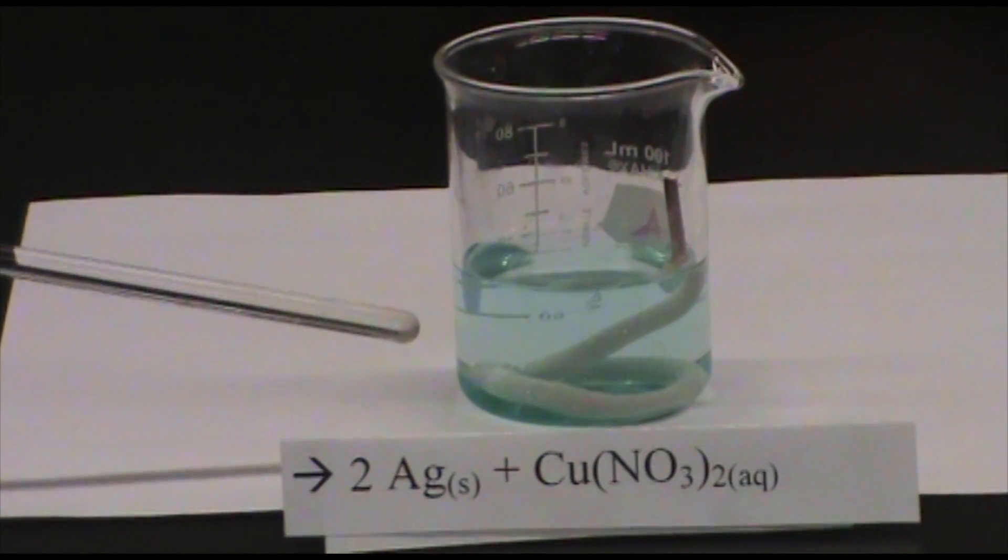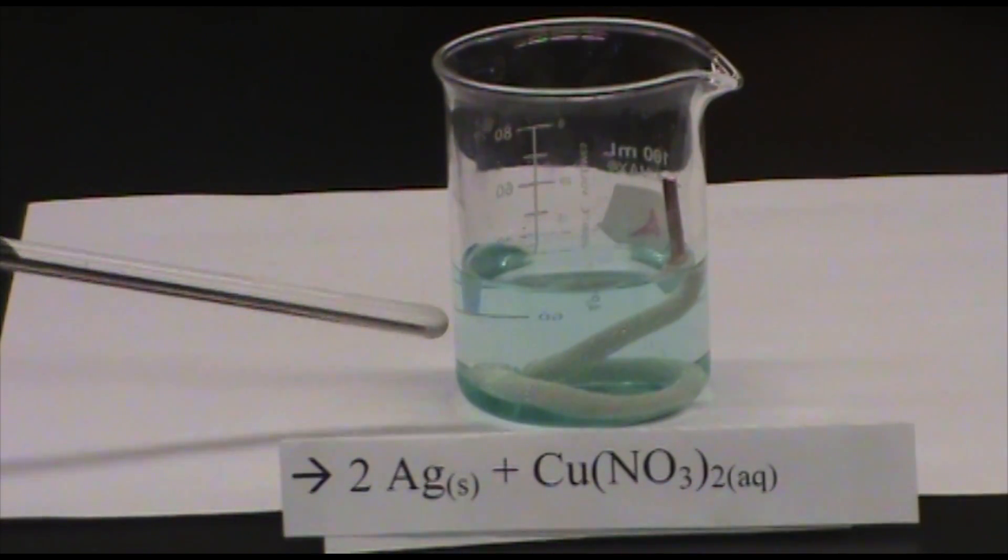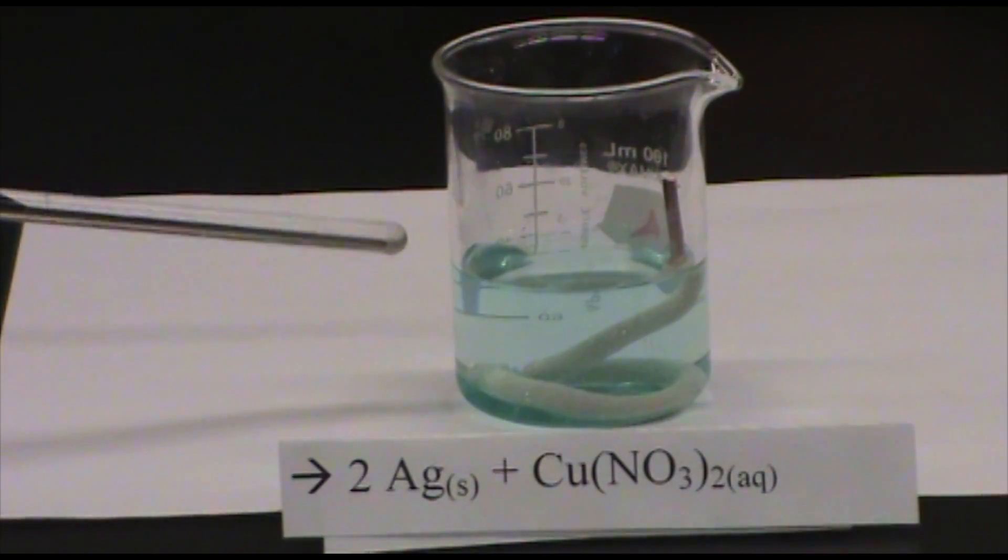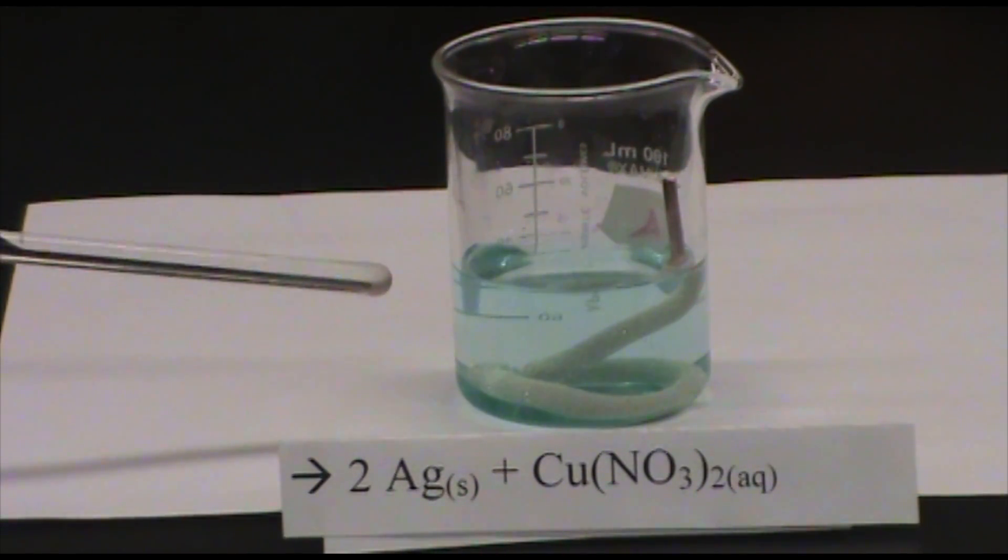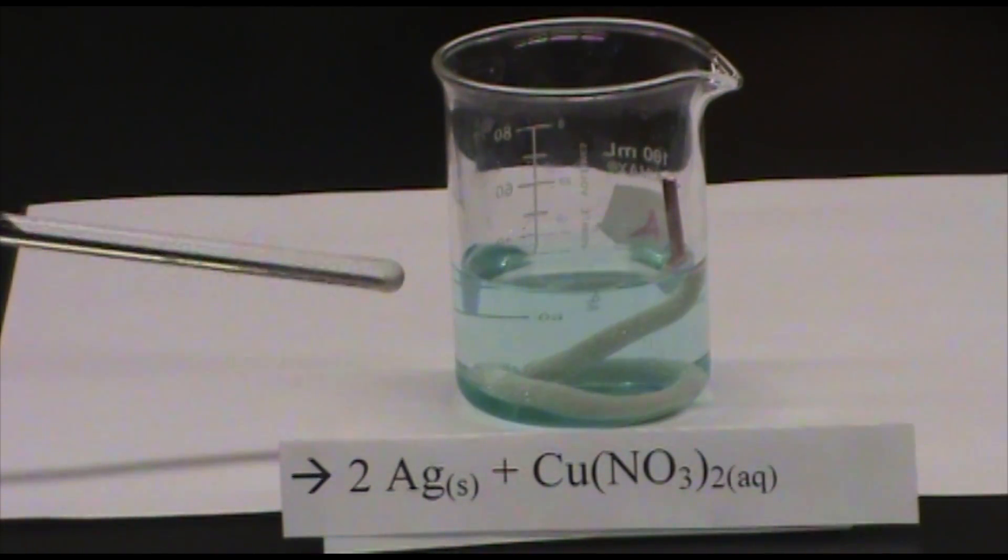As you can see, the silver is precipitated out and is collecting on the copper wire. At the same time, copper is replacing silver in solution as a cation with a plus two charge. This cation has a characteristic color of blue in solution.